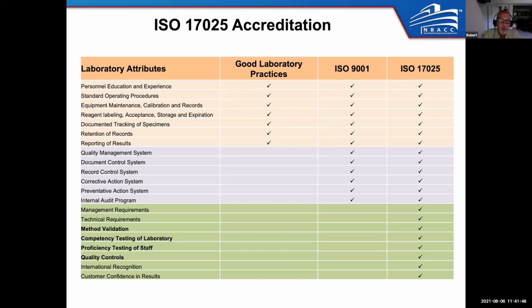Before we can actually use a light microscope, we have to take a stage micrometer and document that the microscope is working properly. Before we use a scanning electron microscope, we have to take, say, a Geller MRS5 or MRS6, because these are ISO accredited, and we have to prove that the microscope is interpreting the magnification correctly and that the microscope is putting the correct size scale bar on the images before we can take any pictures. If we're doing X-ray analysis, we have to take copper, and we have to prove that the detector is working properly by ensuring that the K line is at 8.04.